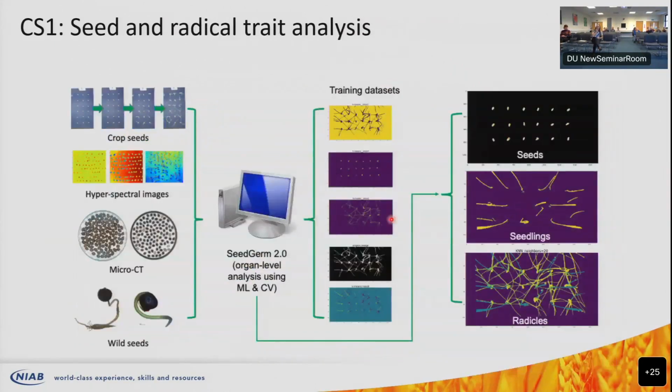And then, building on the newly acquired data sets, we have used a different approach. We call it SeedGerm 2.0. This approach is basically training the data sets.